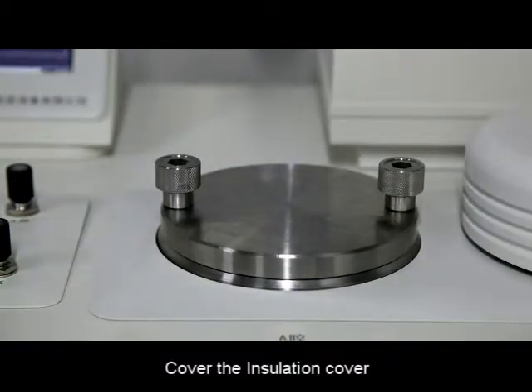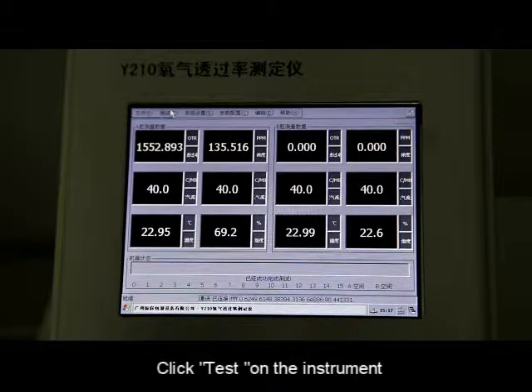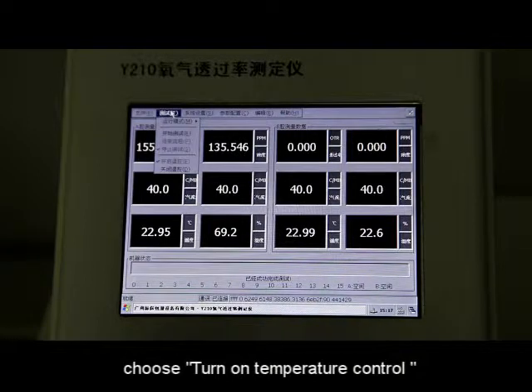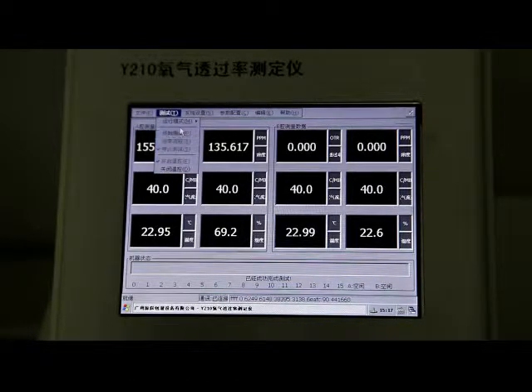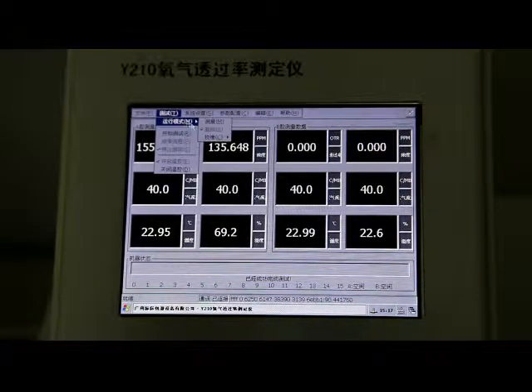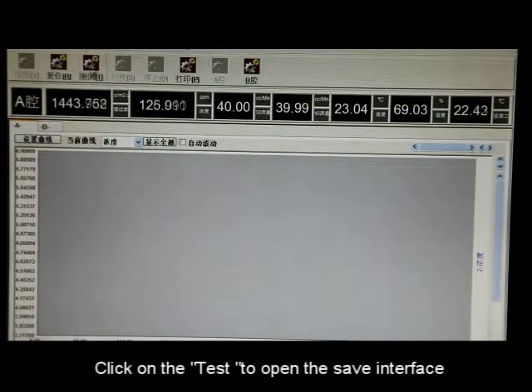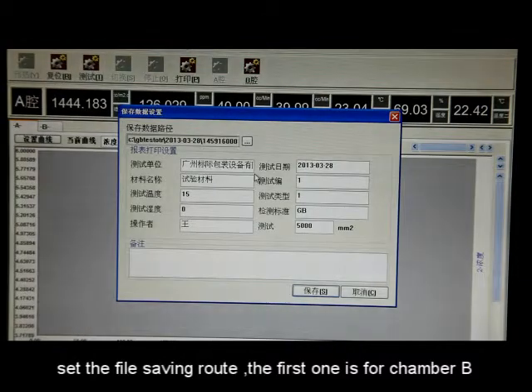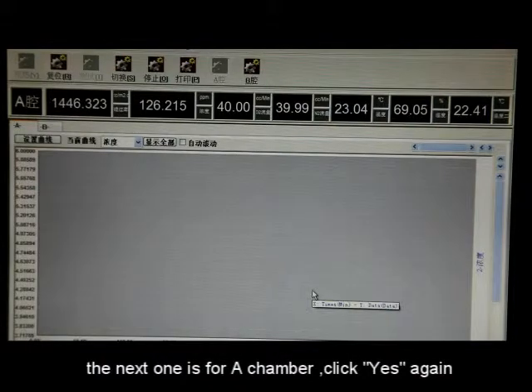Cover the insulation cover. Click Test on the instrument, choose Turn On Temperature Control, click Running Mode, and choose Test. Click on Test to open the save interface. Set the file saving route — the first one is for Chamber B, click Save. The next one is for Chamber A, click Yes twice.